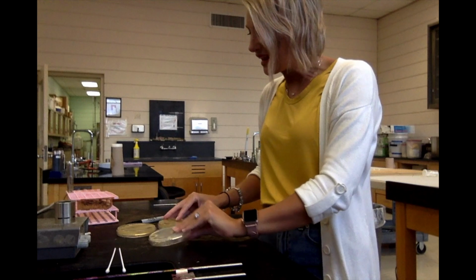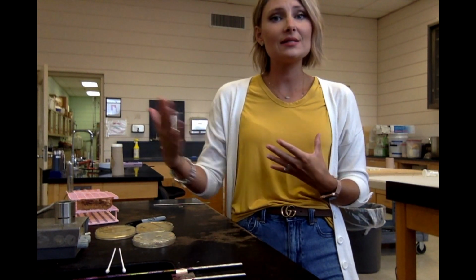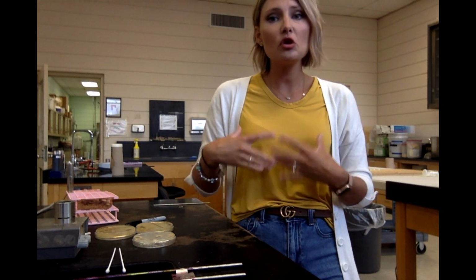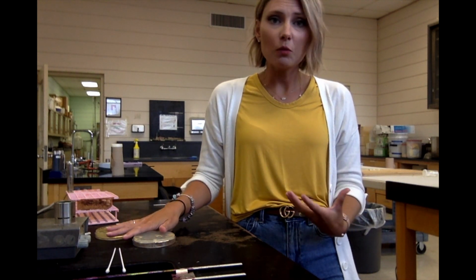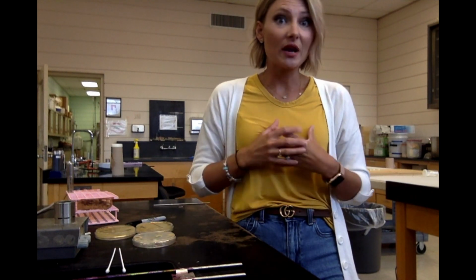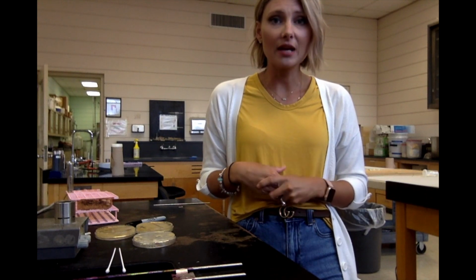Okay. And so again, the point of this exercise is just to show you how easy it is to contaminate your culture in microbiology. We want you to practice aseptic technique so that you're not contaminating things, whether you're working in a microbiology lab one day or a hospital one day. We want to make sure that you understand that bacteria are everywhere, fungi are everywhere, and we don't want to contaminate our samples.